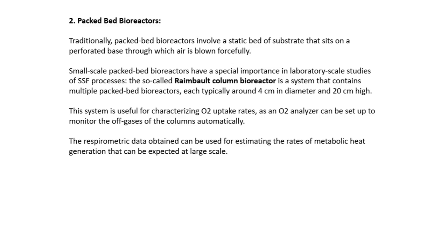The Raimbault column bioreactor is a system that contains multiple packed bed bioreactors, each typically around 4 cm in diameter and 20 cm high. So this is a stacked one. We can stack one on the other so that it is completely packed. So, a multi-packed bed bioreactor.